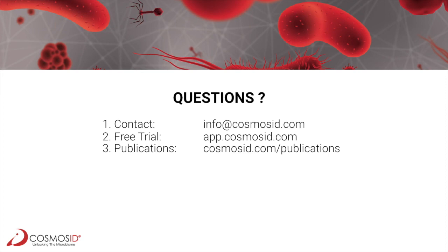And it is a method that's perfectly suitable if you're not looking to resolve organisms at strain level, but maybe just try to understand how alpha diversity or species richness change at species to genus level. So if you're dealing with low input amounts, 16S is an option, but it can't give you all the answers. But it could be a first step towards certifying microbiome safety, for example.